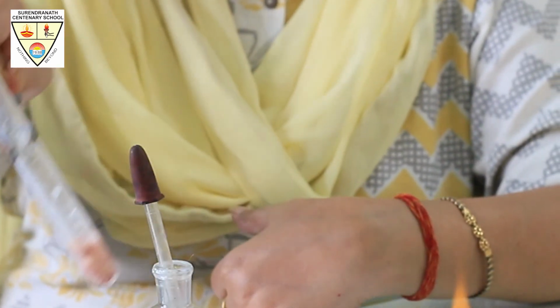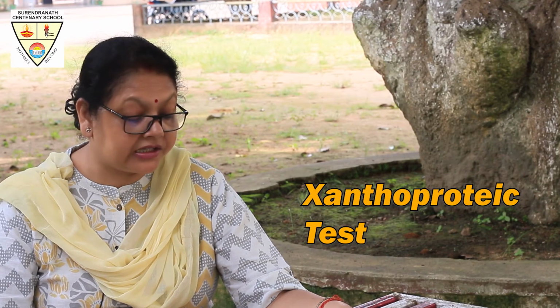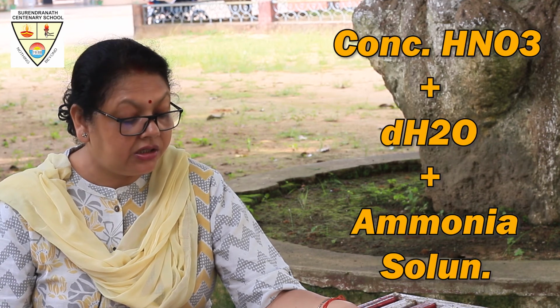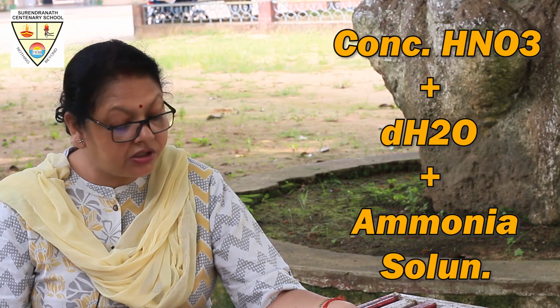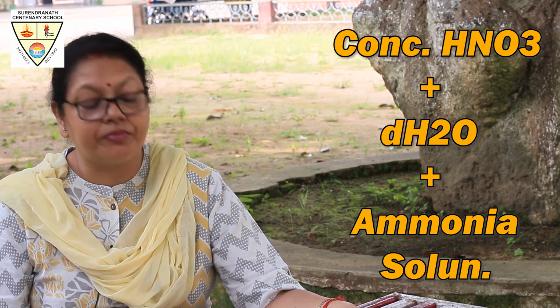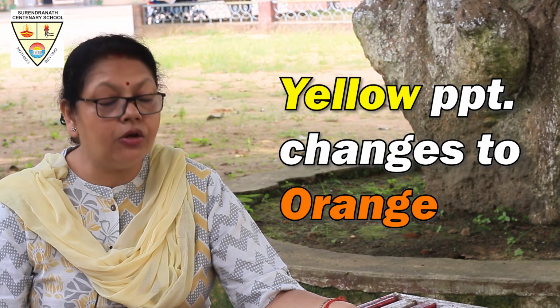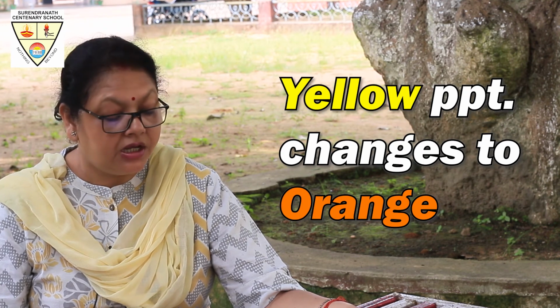We can also have another test, the next one, called the Xanthoproteic test, where you take the protein solution in a test tube and add 2-3 drops of concentrated HNO3, cool it, dilute it with water, and add a few drops of ammonia solution slowly. You will find the yellow precipitate that you have observed changes into an orange precipitate, which confirms the presence of proteins.